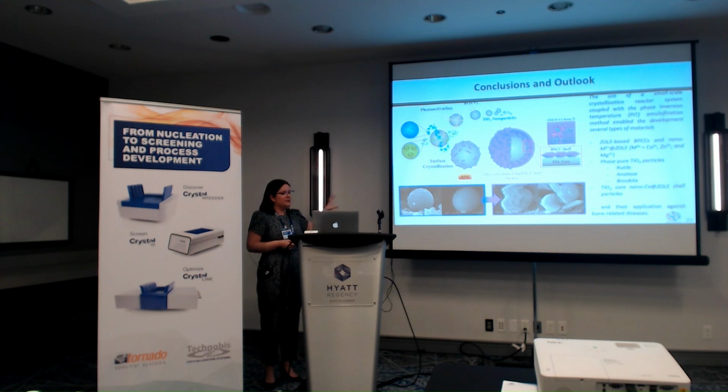This is the first method that can get you to all of these three phases with a starting point, and only differing on the calcination temperature. And then we also developed the titanium core that were surface crystallized with the coordination complex in a single particle. And I haven't shown you that data here, but we also probed their application against bone-related diseases, specifically metastatic breast cancer.